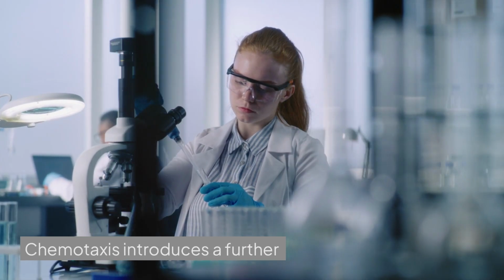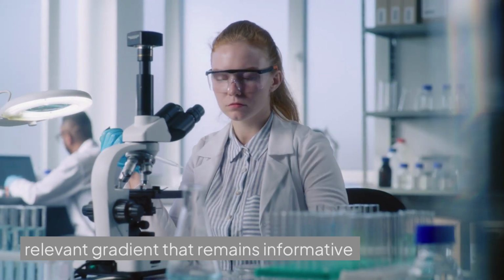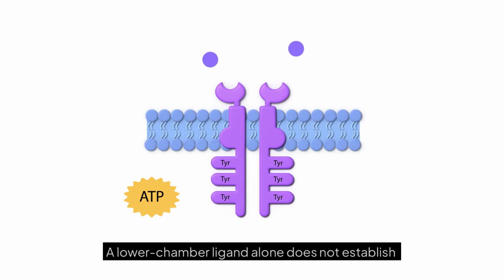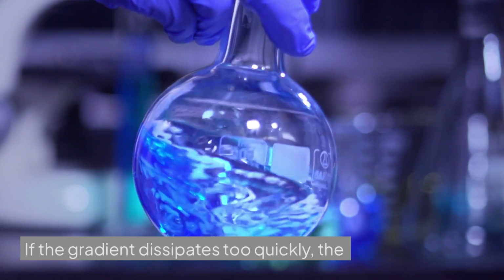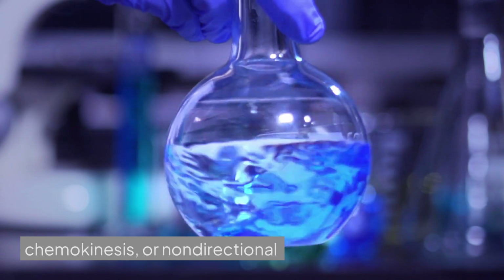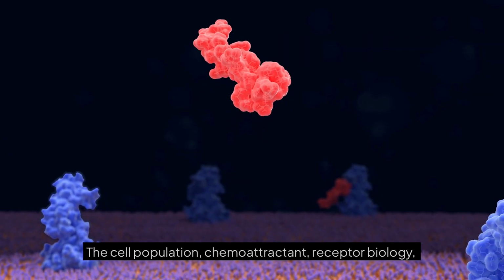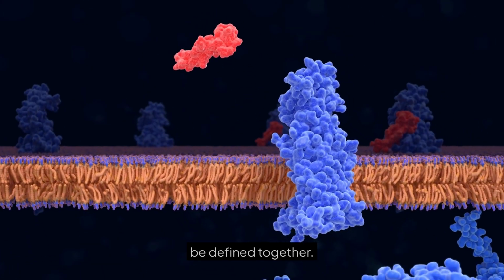Chemotaxis introduces a further requirement: a credible, biologically relevant gradient that remains informative during the incubation period. A lower chamber ligand alone does not establish directional movement. If the gradient dissipates too quickly, the experiment may increasingly measure chemokinesis, or non-directional movement. The cell population, chemoattractant, receptor biology, concentration range, and time window therefore need to be defined together.